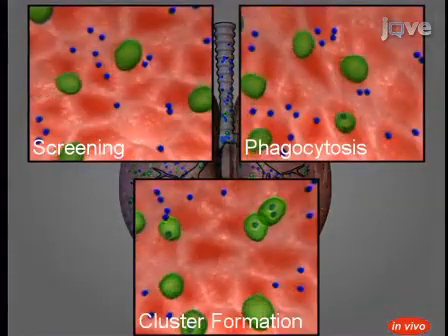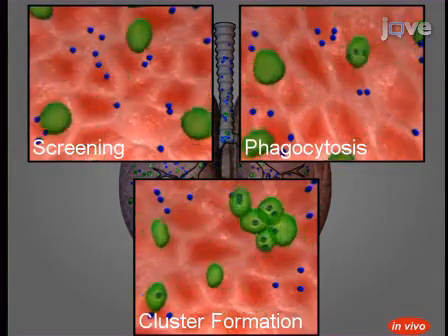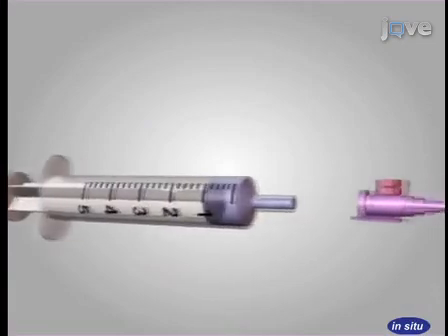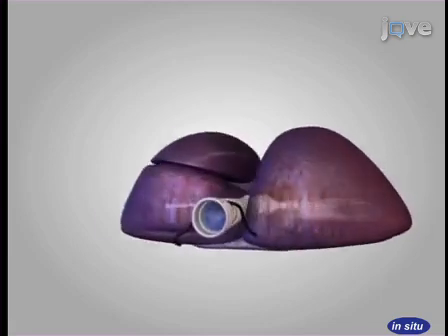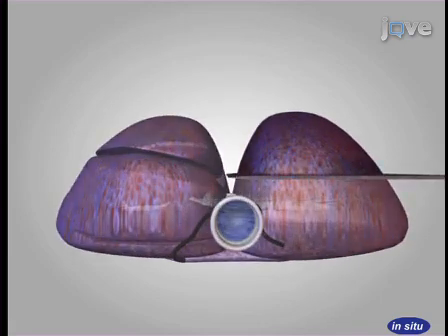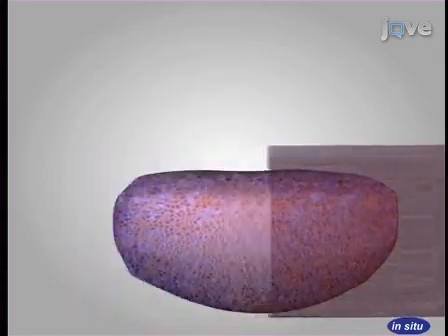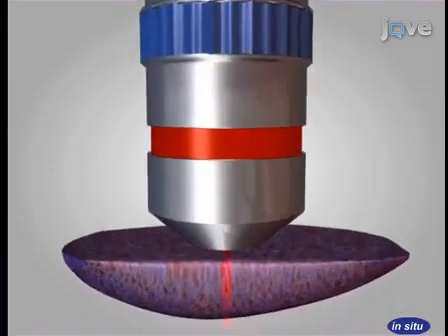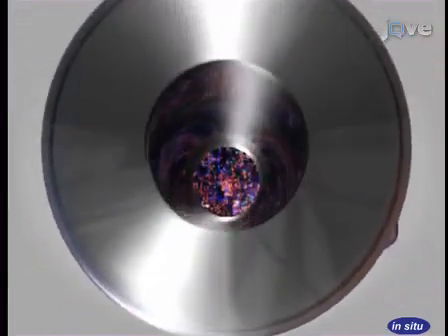Next, the infection is allowed to develop over 7 hours, after which the infected animal is sacrificed. Then, the lungs of the infected animal are filled with low-melting agarose to facilitate sectioning by vibratome. Finally, a thick slice of the infected lung tissue is acquired via vibratome, and lung neutrophils, DNA nets, and fungal elements are imaged. Ultimately, high-resolution still images or movie sequences of granulocytes in live lung tissue can be obtained through multicolor two-photon microscopy.